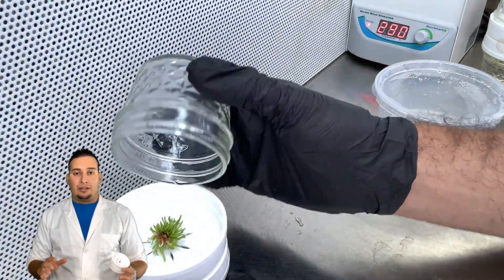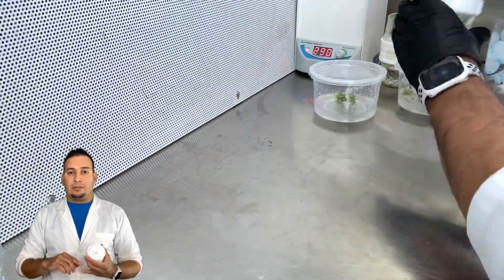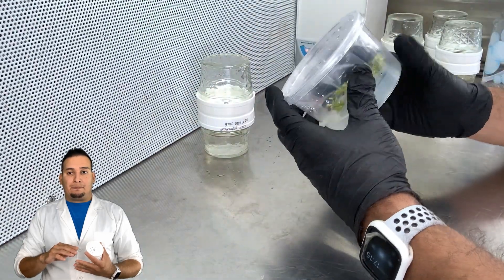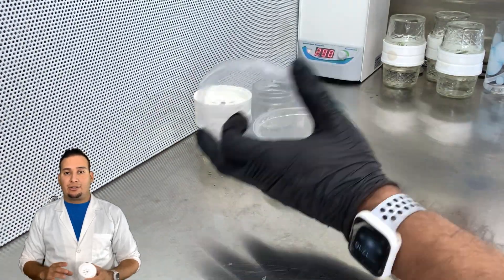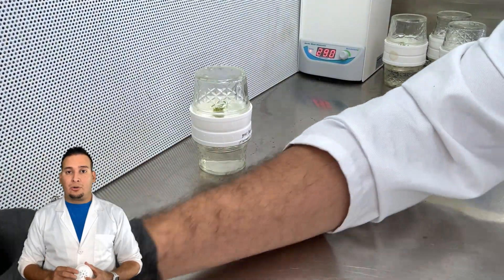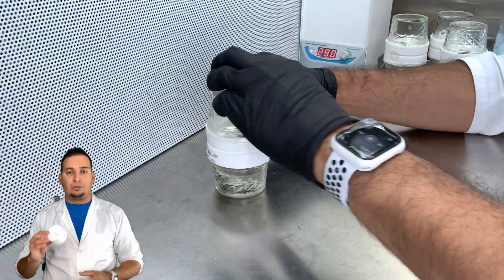The plants I'm working with are carnivorous plants. I started with Nepenthes tunkara, Darlingtonia californica, Cephalotus follicularis, and Heliamphora minor — those are the four plants I worked with. Now this video is pre-recorded from back in May when I started doing experiments using the BioCoupler.